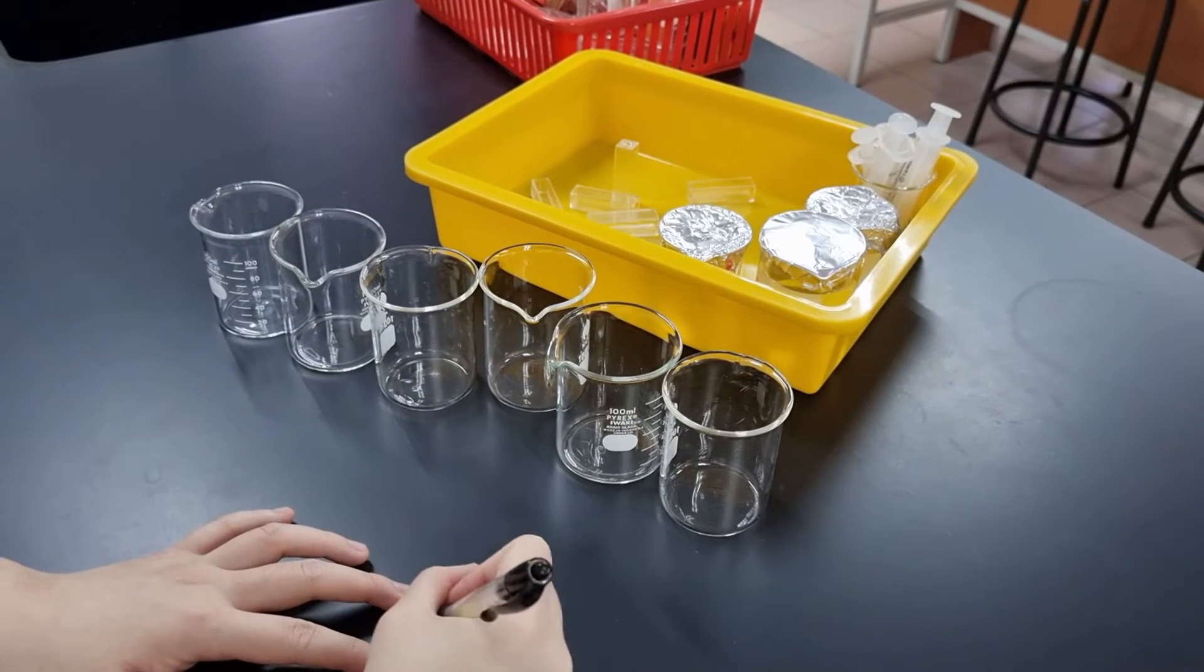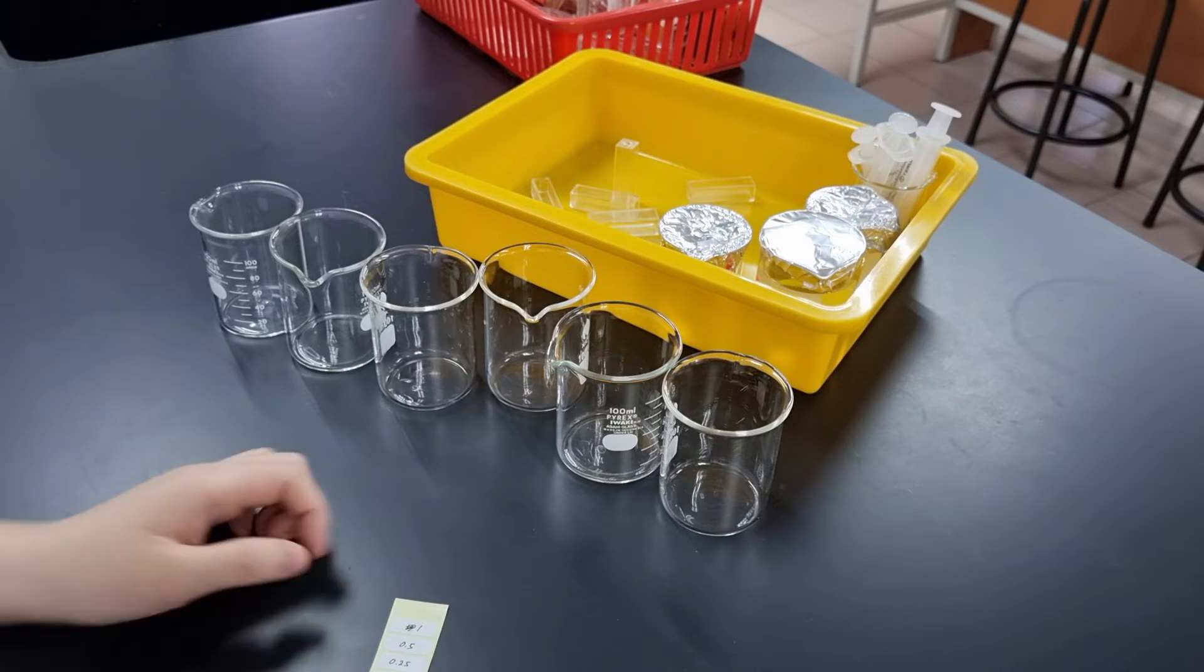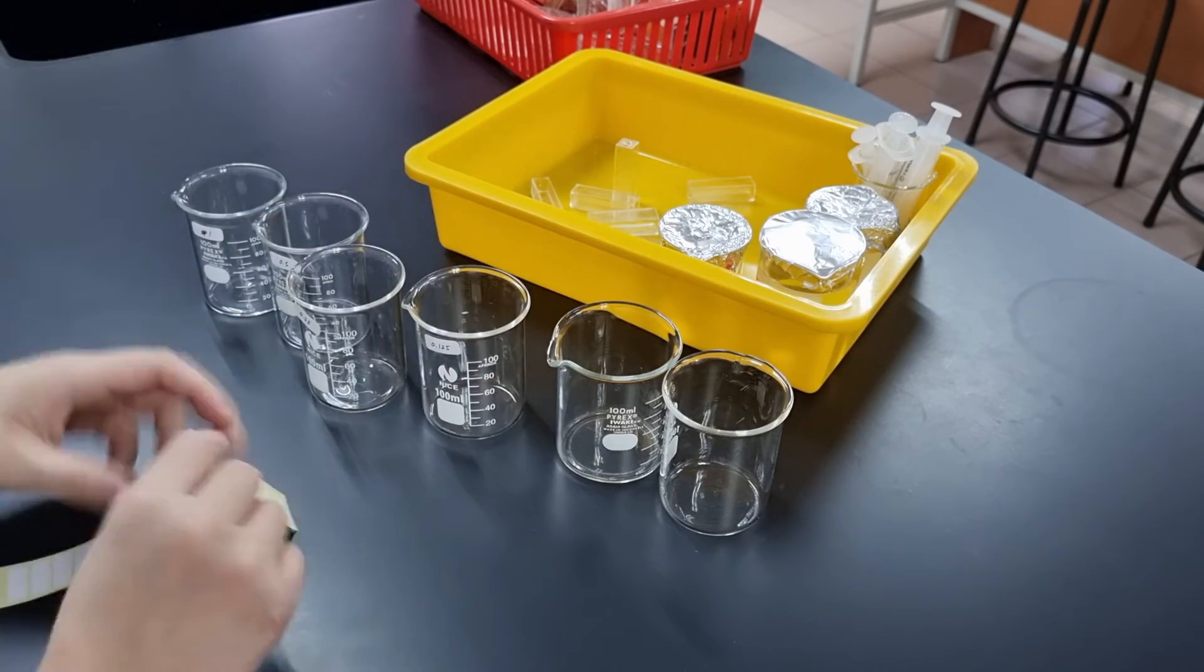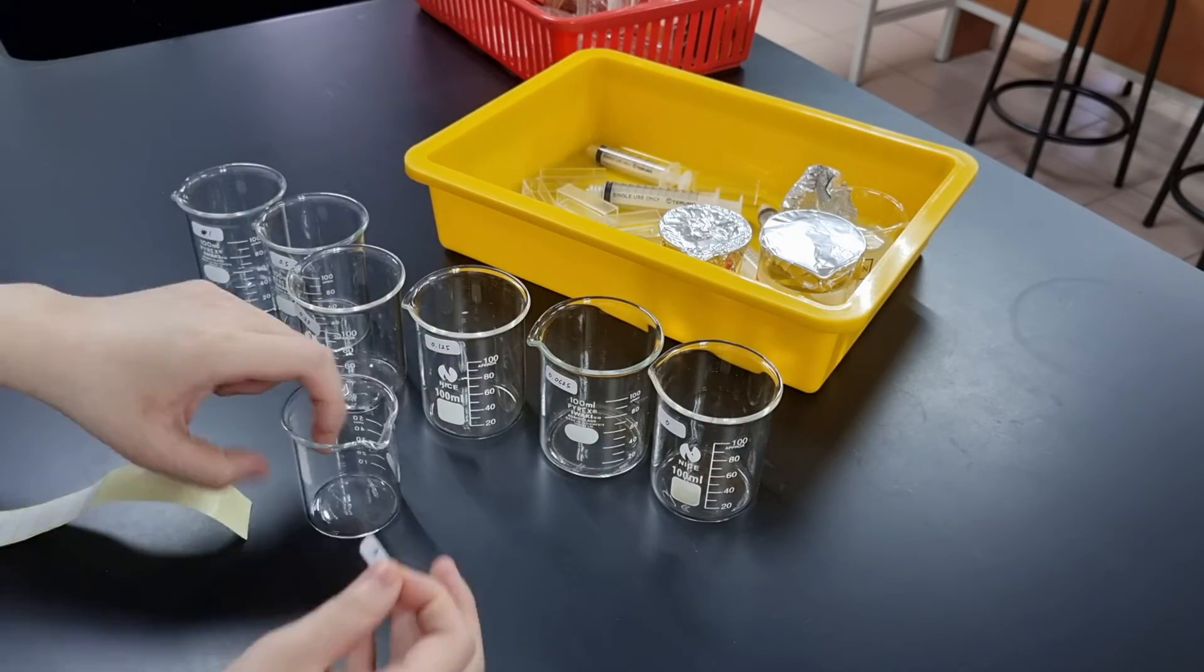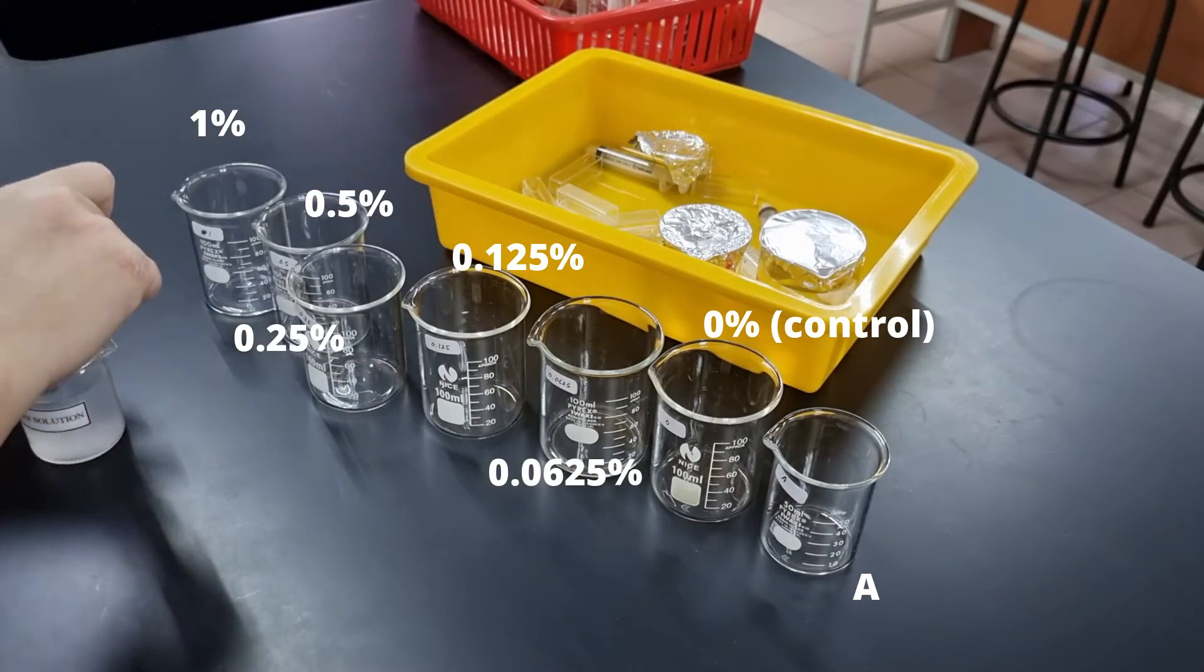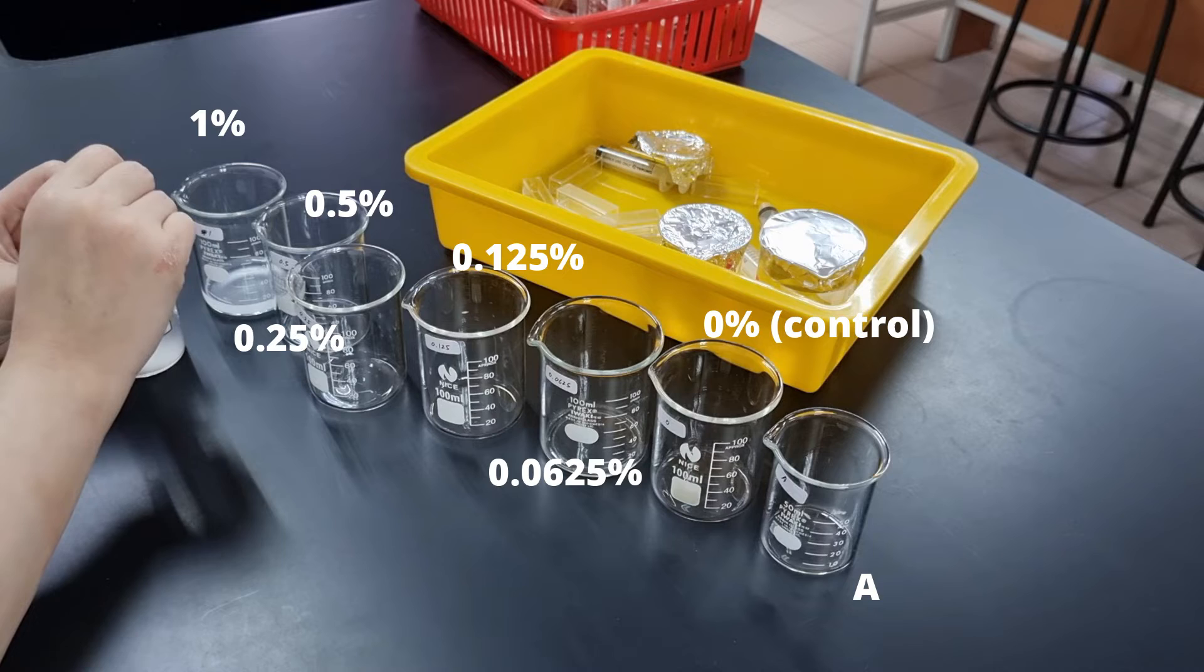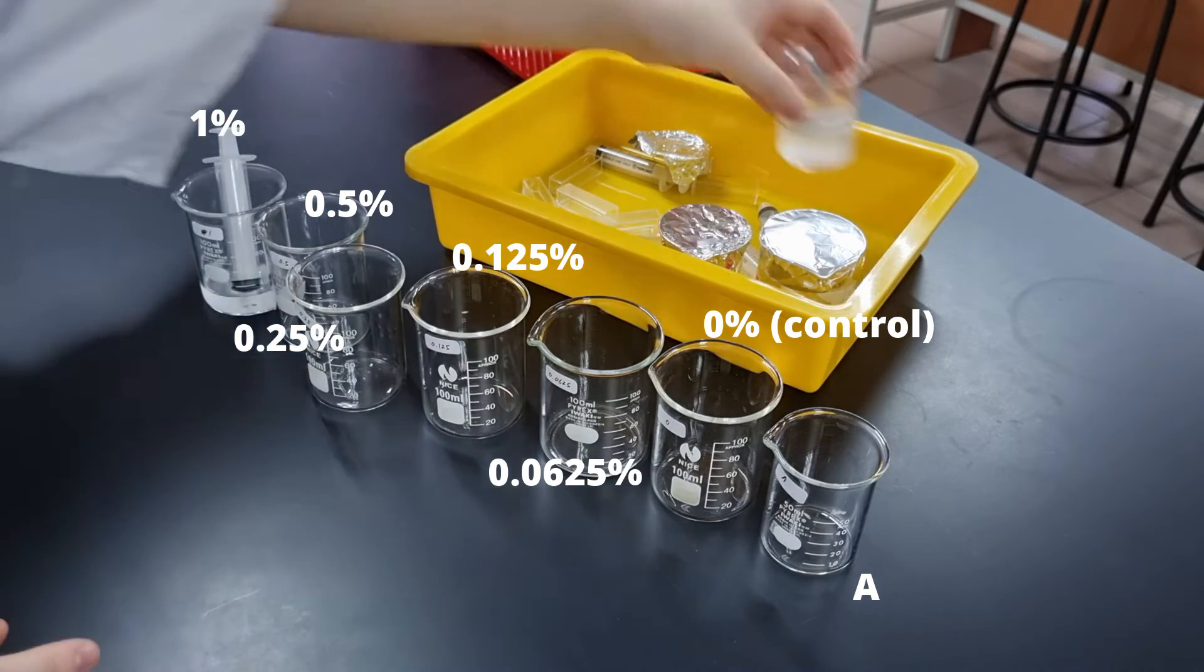Now that we are done with our calculations, we can then proceed to actually perform serial dilution in real life. Make sure to label your beakers. We have seven different beakers here. Because other than the five concentrations, we are also doing one that is zero percent, which acts as a control. So it's just 10 cm³ of distilled water. And also, beaker number seven would have unknown solution A.